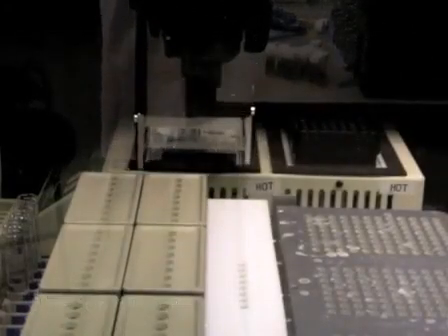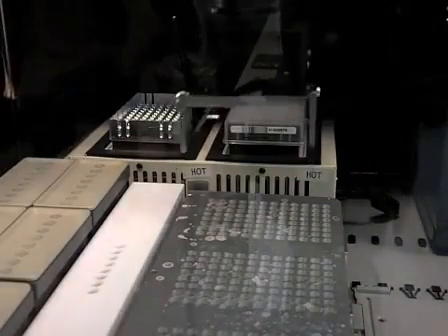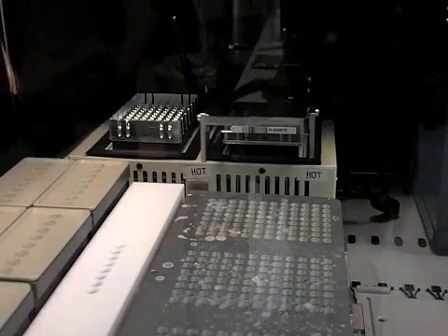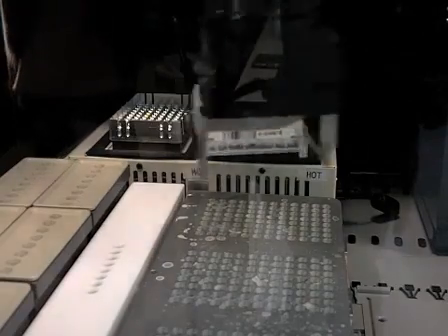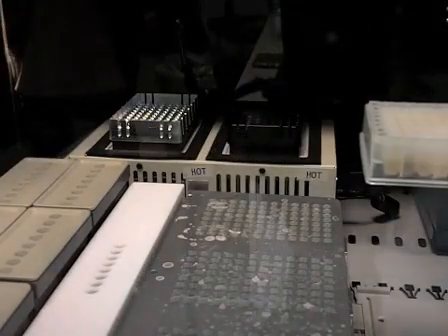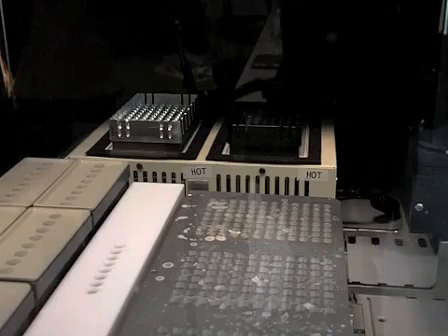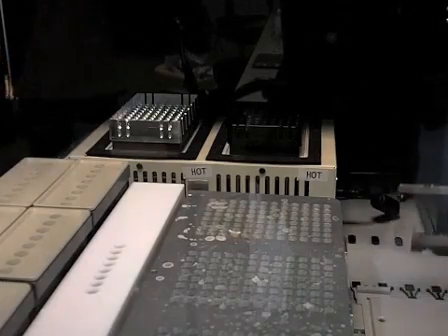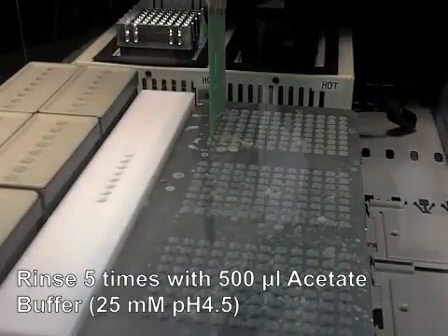The plates are transferred to the heating block and incubated at 90 degrees for 20 minutes. When this incubation is finished, the pre-treatment is removed by rinsing 5 times with 500 microliters acetate buffer.